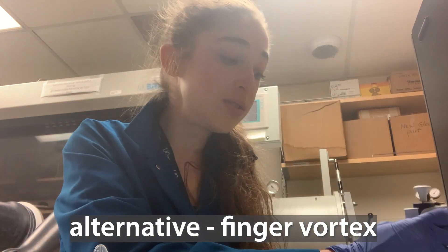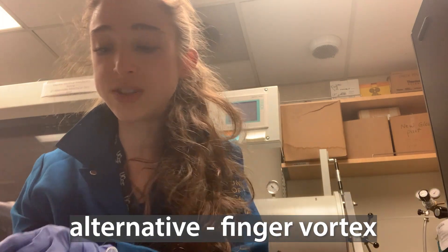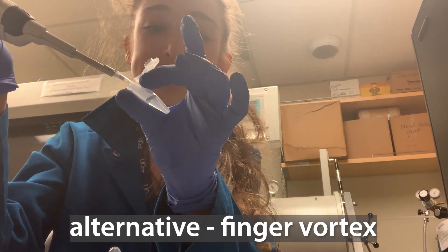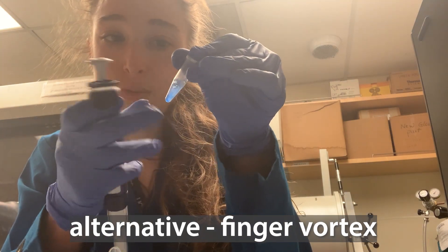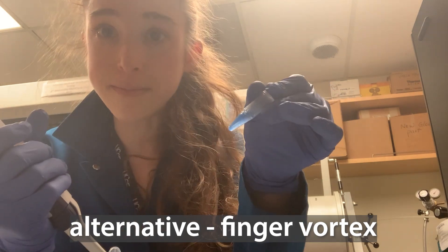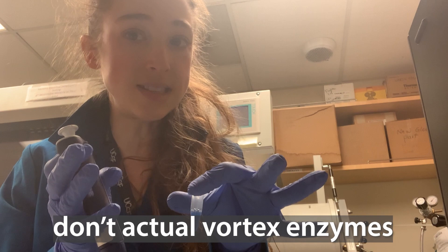Alternatively, you could skip pipette mixing altogether and use my favorite thing — the finger flick — or do a little bit of pipetting first. A really great way to mix things is the finger vortex. You just kind of spin it and it gets nicely mixed. It's kind of fun. You're able to finger vortex even if you have an enzyme in there — something that's sensitive.